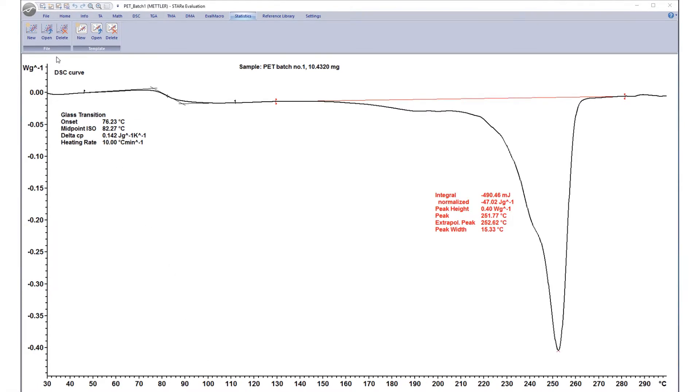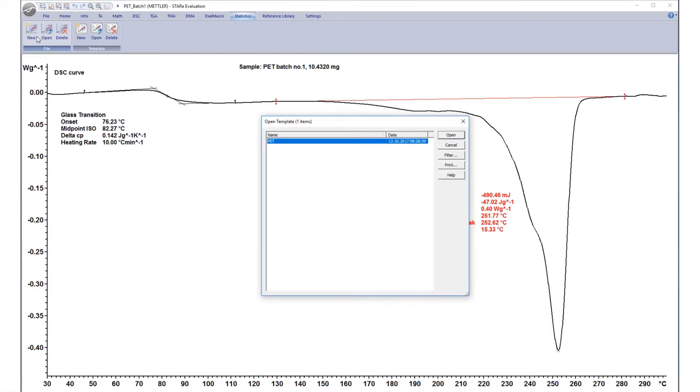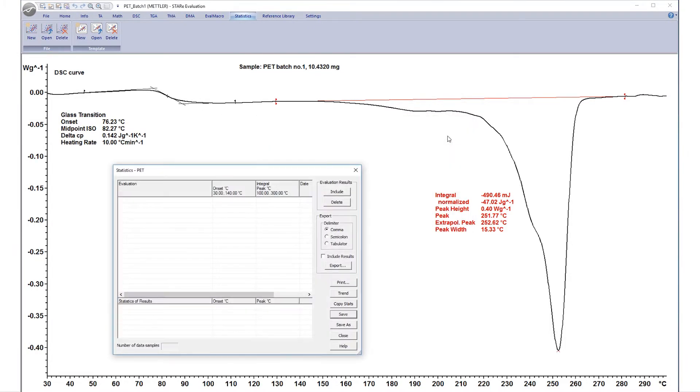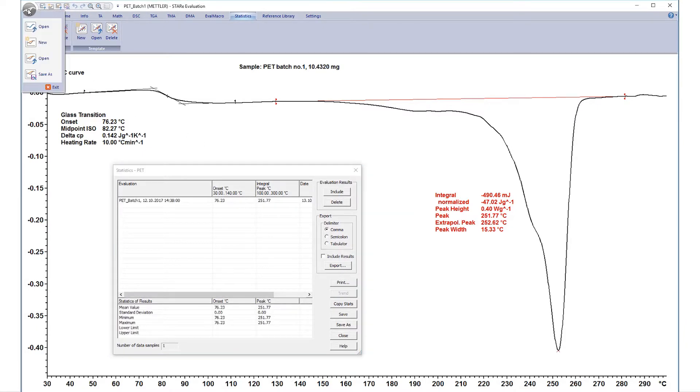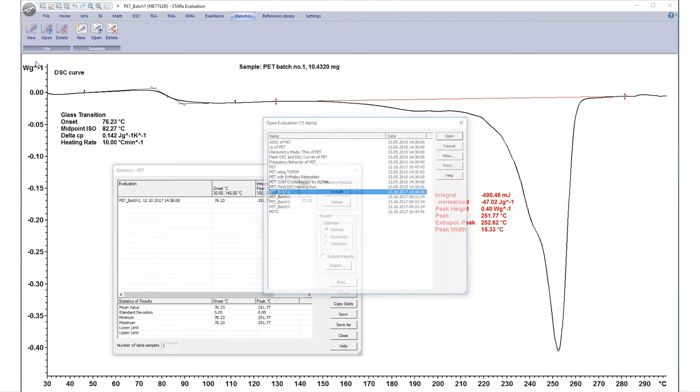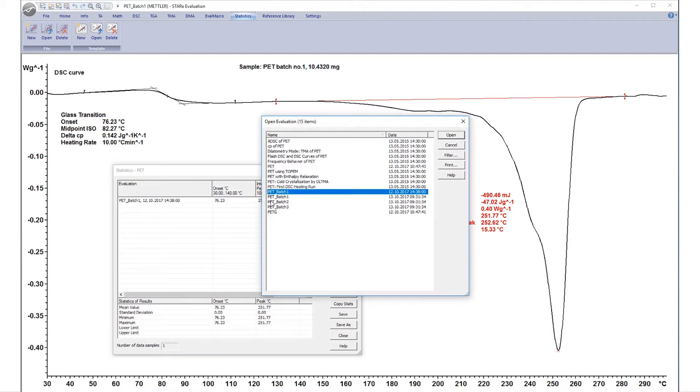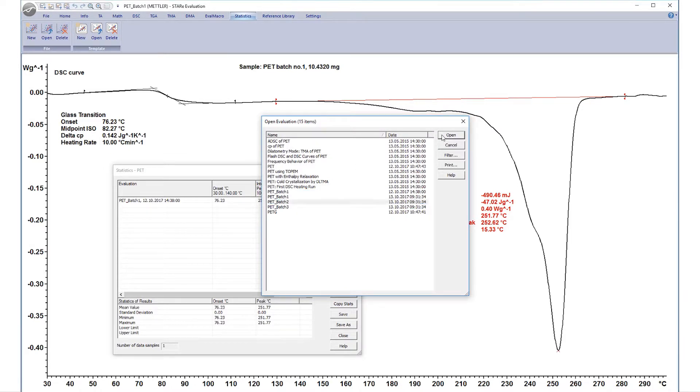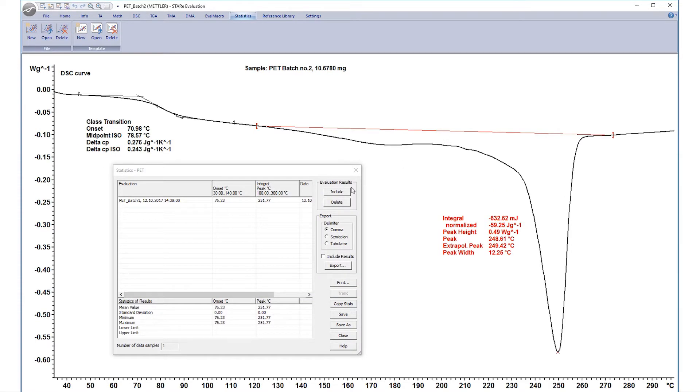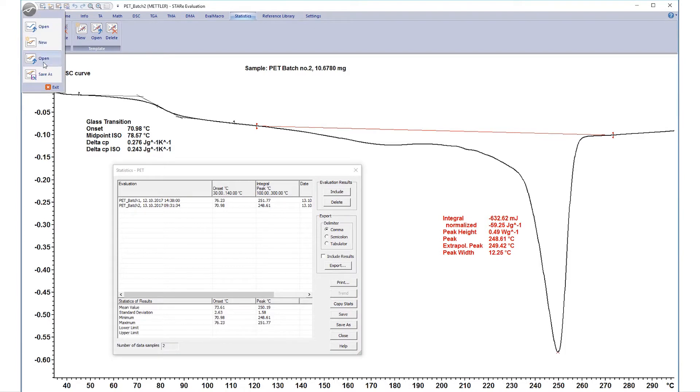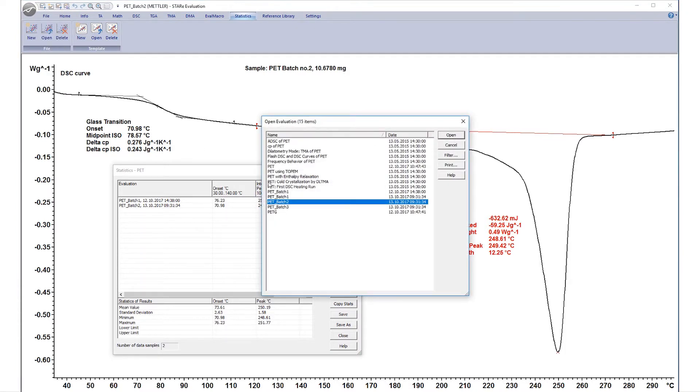Finally, create your table by once again selecting New, but this time under File. Open the template you just created and click Include to transfer the results from the Open PET evaluation. This can be done for more than one evaluation, for example, PET batch 1, 2, and 3.